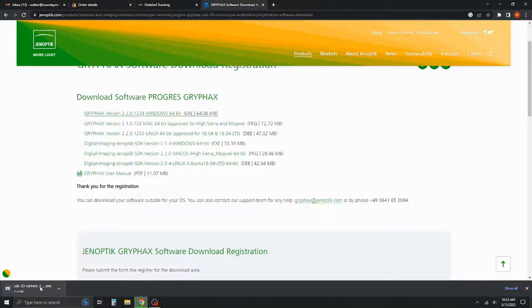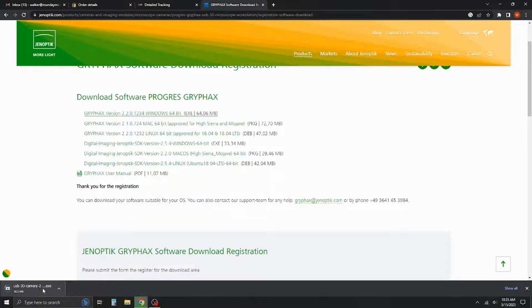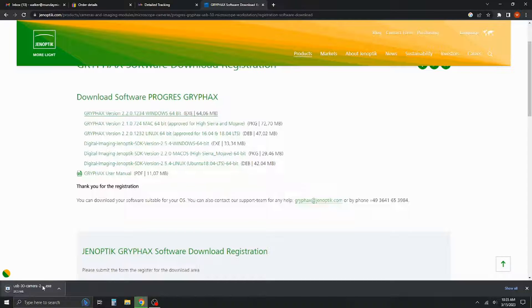This package does include the drivers. It's a bit of a big file, so it does take a second or two to download, but not too long.